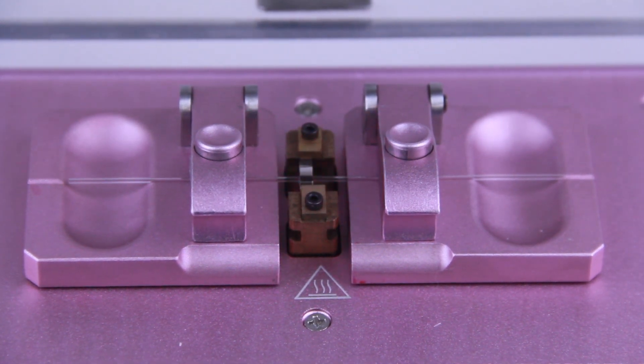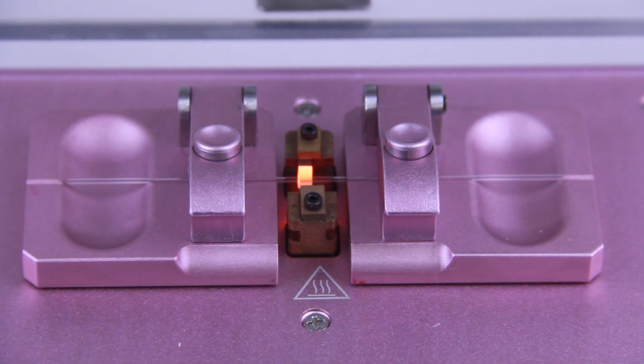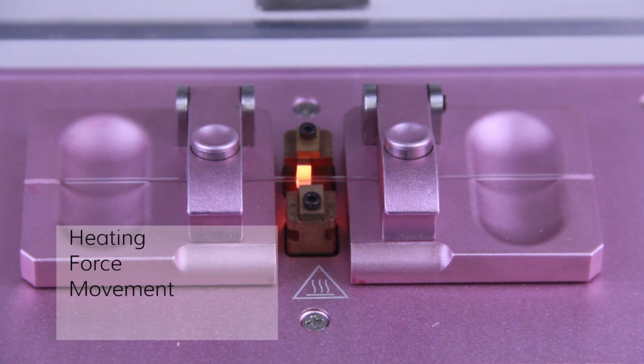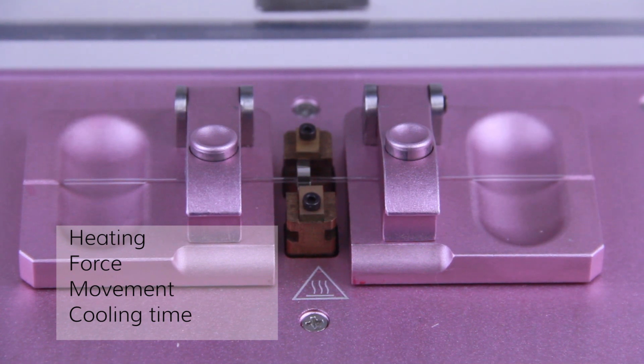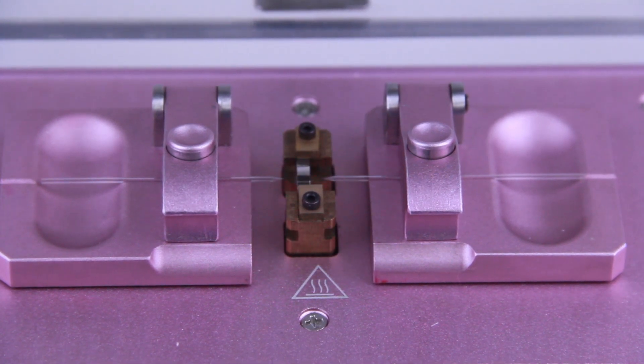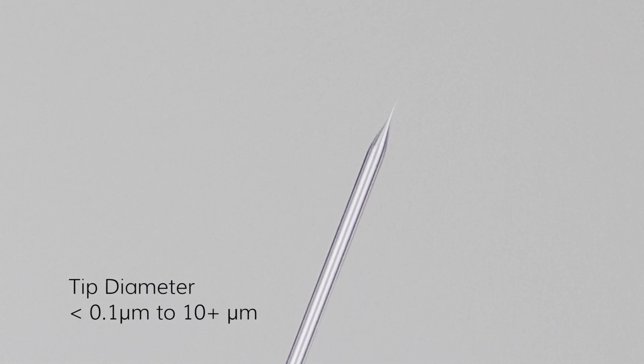The puller was designed with tight mechanical specifications and precision electronics for complete control of the pulling process and for accurate reproducibility. It offers programmable sequences of up to four steps with complete control over the heating, force, movement, and cooling time. This allows graduated cycles for a variety of applications. The Pull 1000 can produce pipettes with tip diameters from less than one tenth of a micron to over 10 microns.